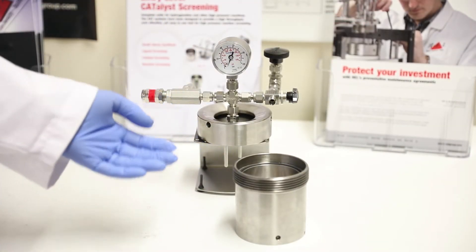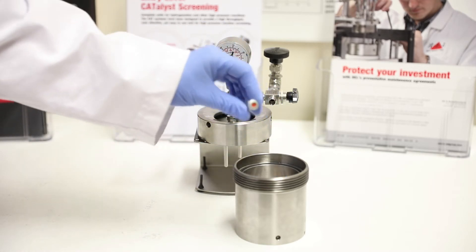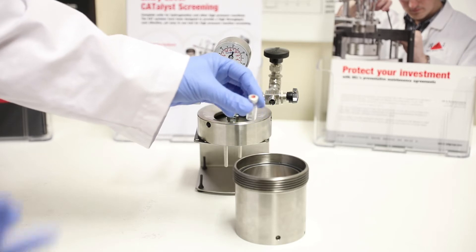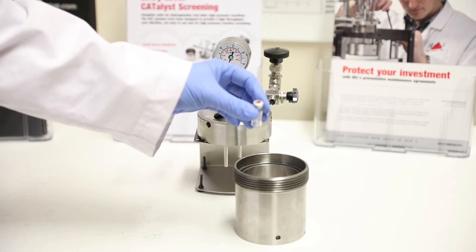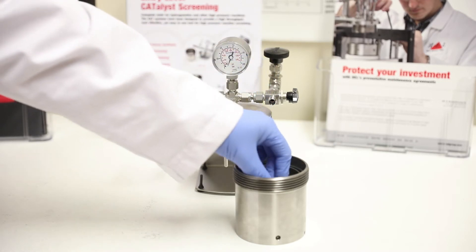Finally we have our CAT 18. This is the simplest of the CAT units and it uses the standard HPLC vial. We use these with lids on because with the pressure of gas that you put in there, the gas will permeate straight into the vial, and the lid stops bumping and contains all the reaction within the vial.